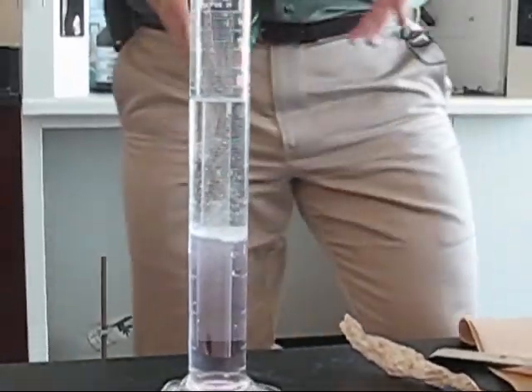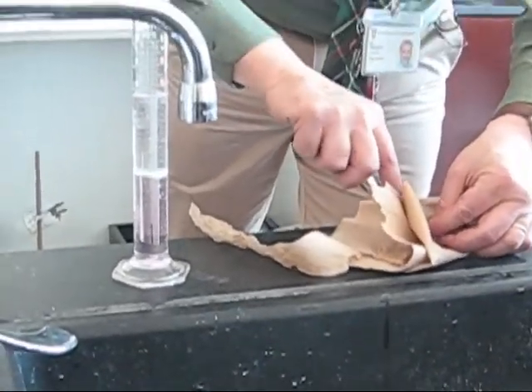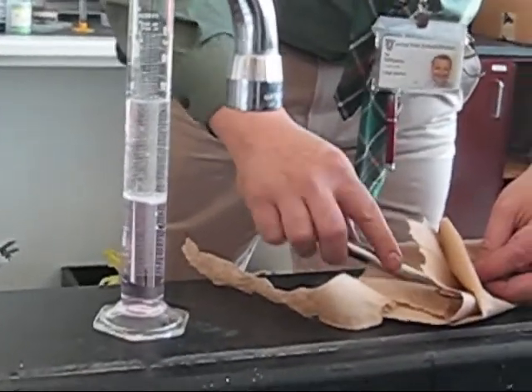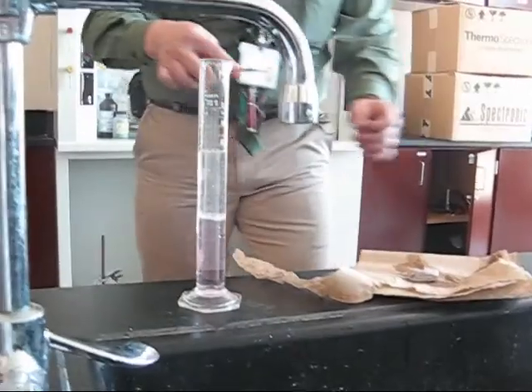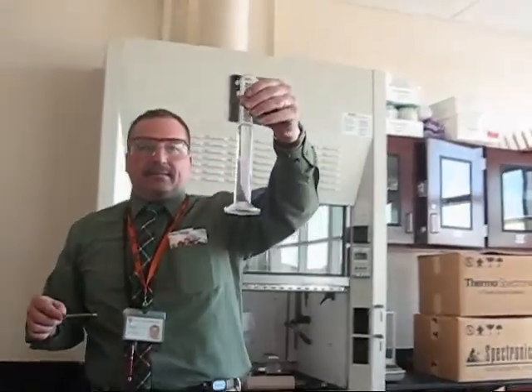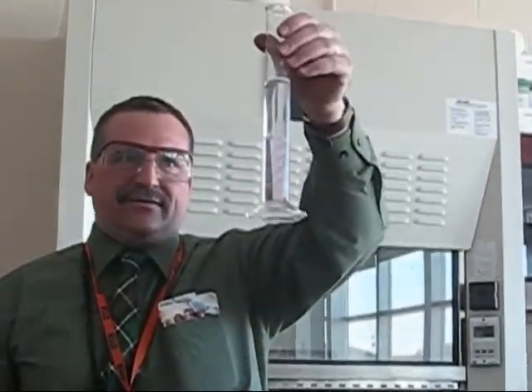Now, here's the deal. Sodium's density is almost the same as water, but it is more dense than mineral oil. So if I drop a piece of sodium in there, it will sink down through the mineral oil and hit the water. And what happens when it hits the water? There's a reaction, and that reaction will occur right at that interface.